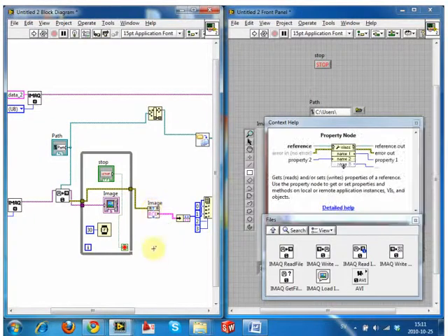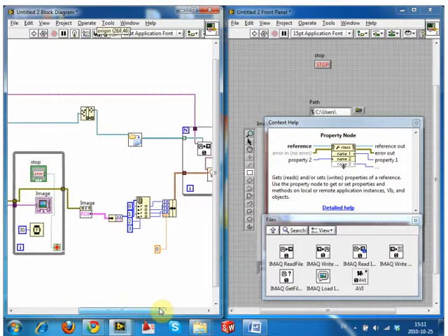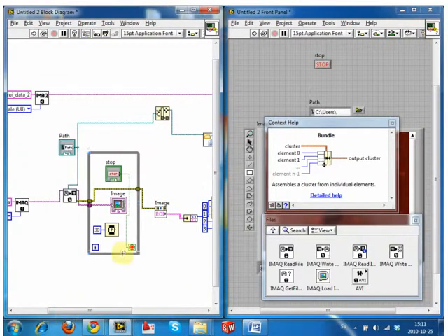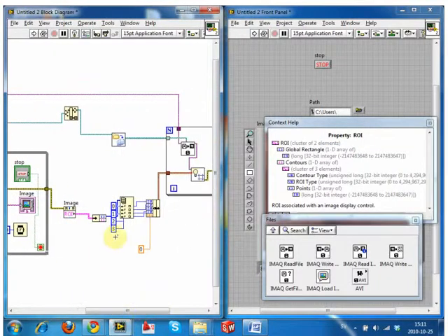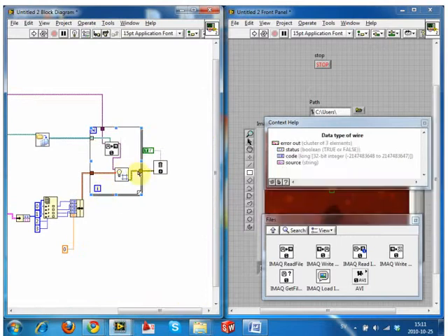What that does is, if you follow it backwards, this loop here requires data from these things, which require data from the ROI, which now, because we wired the error, requires data from this loop. So we cannot read data from the ROI, which means nothing after the ROI will action until we say okay and this loop stops. If we didn't have this, it would run this before we even do our box. So this is just a quick way of determining the order.